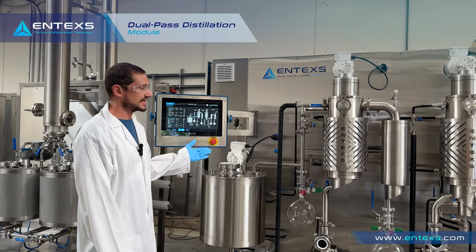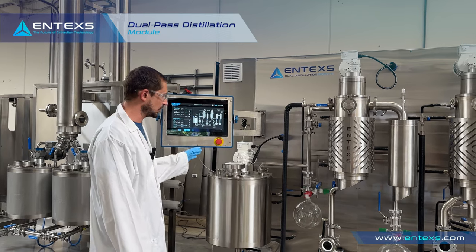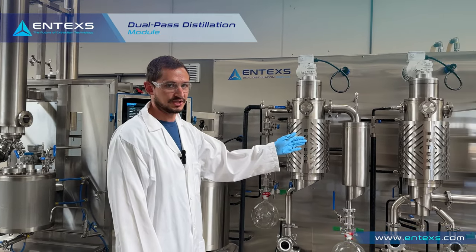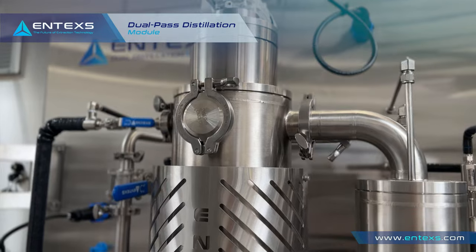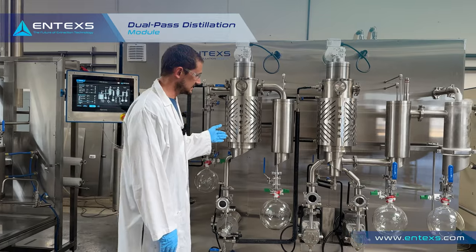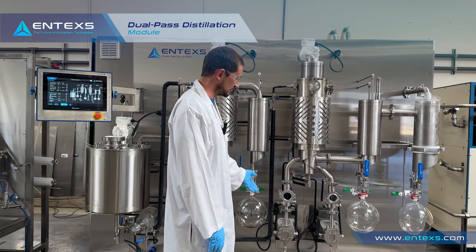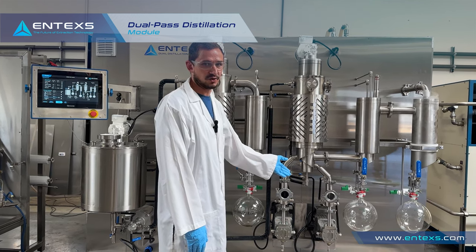This is our ENTEXS dual distillation module. What this does is it takes crude oil — CBD or THC oil — and runs it through two separate stages of wiped film distillation. The first pass removes any light components and any residual solvents. This feeds directly into our second stage, which removes any heavy terpenes or residue, and out comes high purity CBD and THC oil.